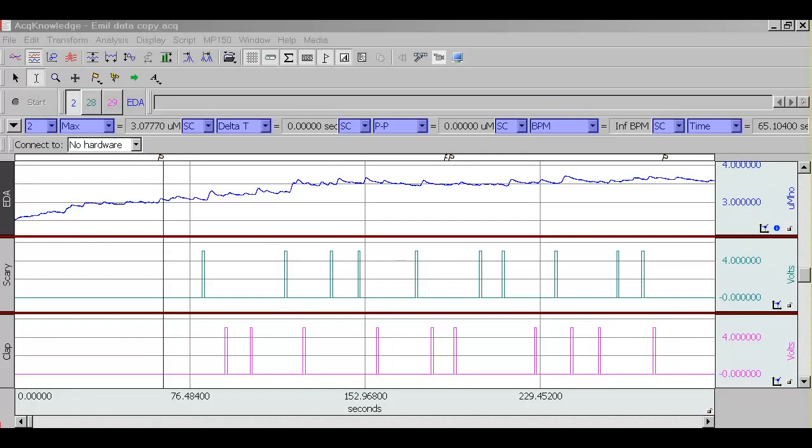You need the recording where we have both the skin conductance data and also the markers that correspond to the stimulation events. You can send digital markers over the parallel port using a program such as ePrime, DirectRT, or you can also do that via SuperLab. And what you get is these new channels, as you can see below here, underneath the skin conductance data.